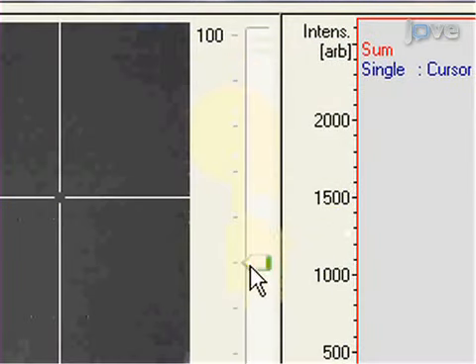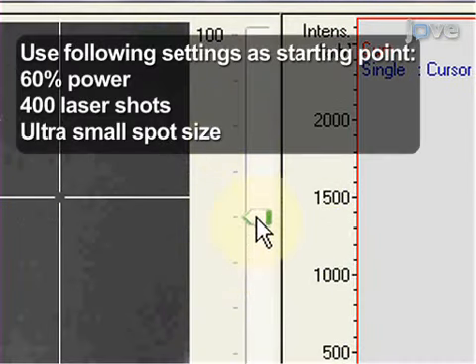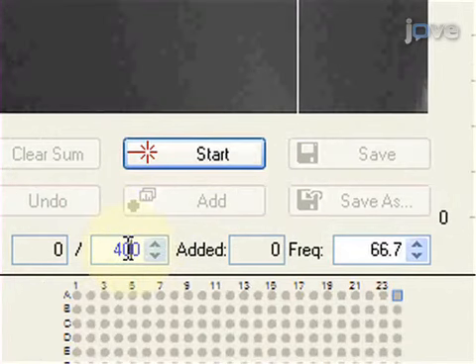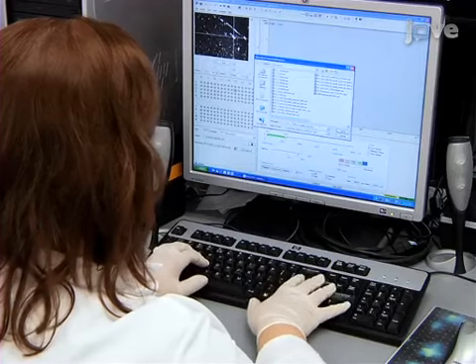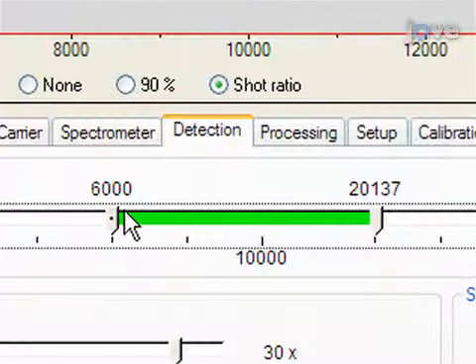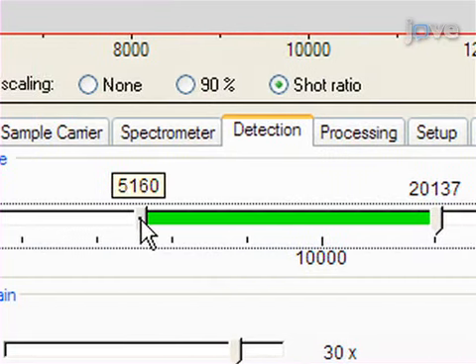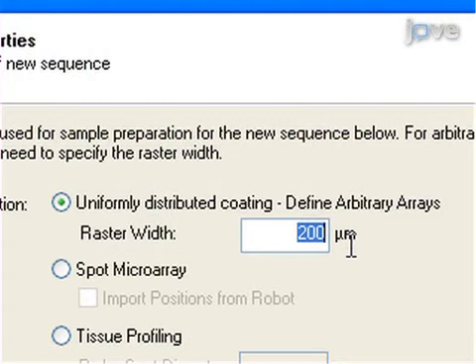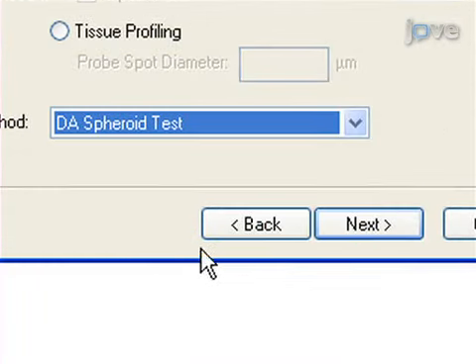Following this, adjust the laser power, frequency, number of laser shots, and spot size using the calibration solution and a nearby sacrificial three-dimensional cell culture slice. Save this method for use in the imaging software provided by the instrument manufacturer. Develop protein data acquisition methods for the mass range of choice as previously described. Then, set up the specific MS instrument parameters using the imaging software.